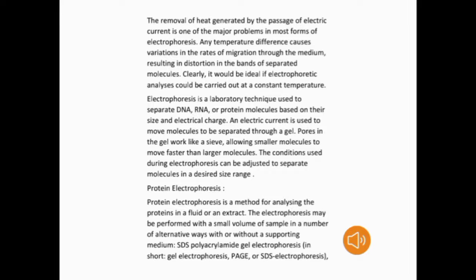Like in protein electrophoresis, electrophoresis is a method for analyzing the protein in a fluid or an extract.